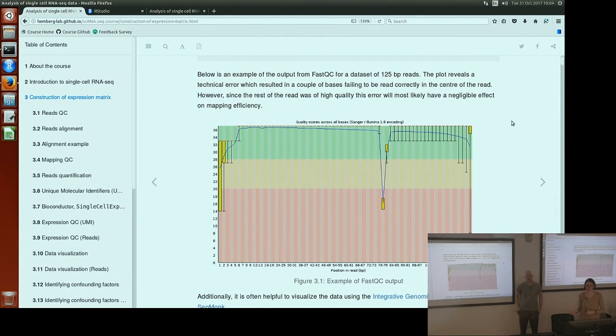Some sequencing facilities will demultiplex your data for you before they send it to you. Sometimes they won't. Generally you'll have multiple cells per lane. For this experiment, I believe we had 4 lanes for 200 cells. You might have 4 lanes for 10,000 cells, or 1 lane for 100 cells. It depends on how deeply sequenced and how many cells you're looking at.